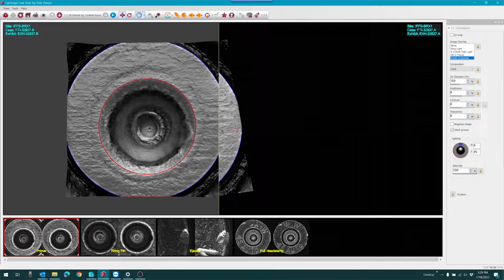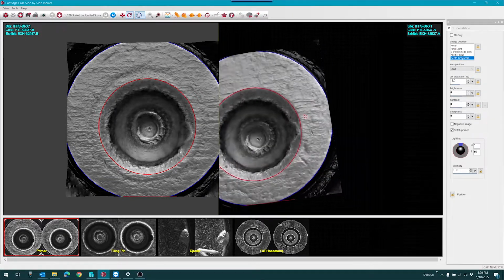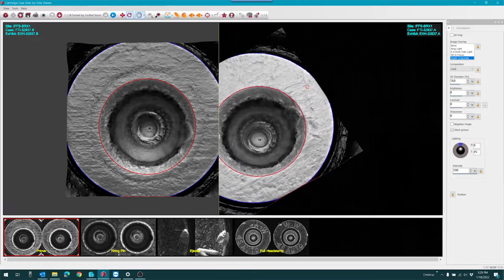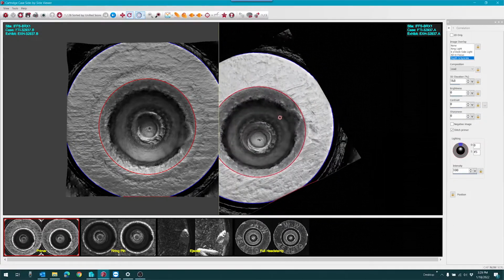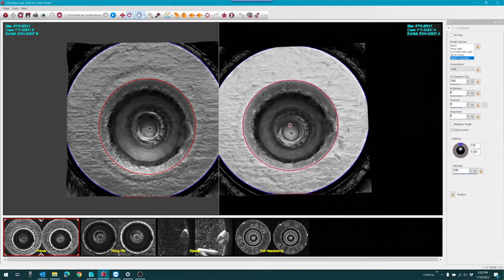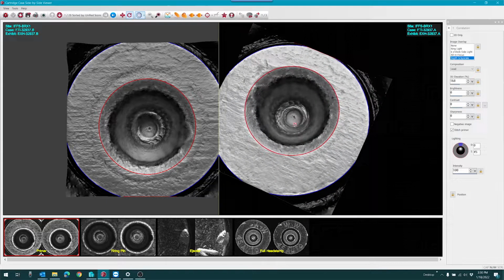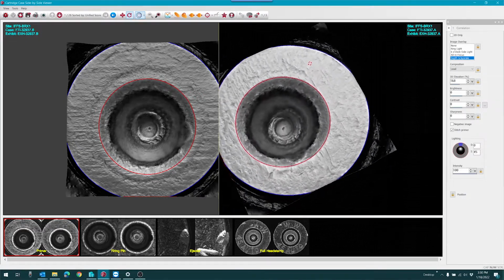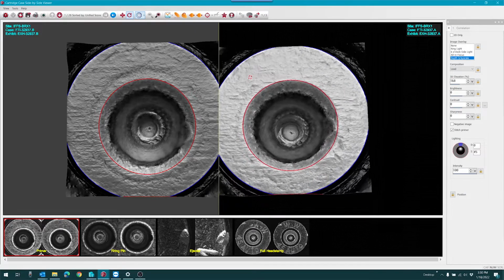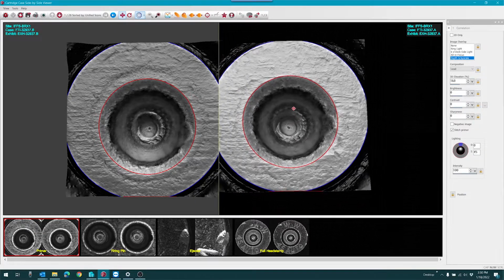So there are actually three movements there. There is the XY axis, there is the 3D pivot, and then holding both buttons down, there is the spin that you can do. And where you grab it does make a difference. If I grab it too close to the center and try to do that spin, it's going to be all erratic. If I grab it from the outside edge, where I've got a good distance to the center point of that rotation axis, I've got a lot more fine-tuned control to get stuff lined up just the way I want to. So be aware that where you click on that image does matter. I tend to stay away from that center point unless I'm just grabbing it for the XY axis.